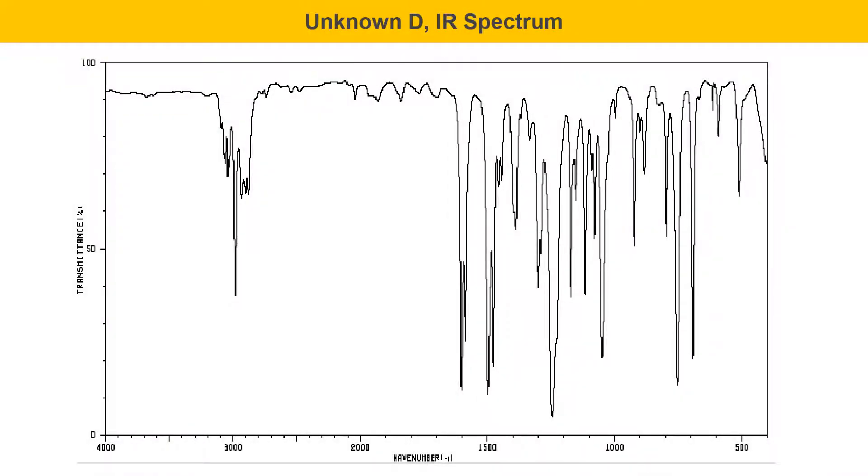Here's unknown D's IR spectrum. One of the things I'll tell you is that there is a peak here at 1500 that's significant to get. The fingerprint region kind of starts at about 1500, but if you see a peak at 1500, that could be something significant. So you should try to figure that out. There's one particularly strong peak in the fingerprint region at 1250 that you might find useful as well.